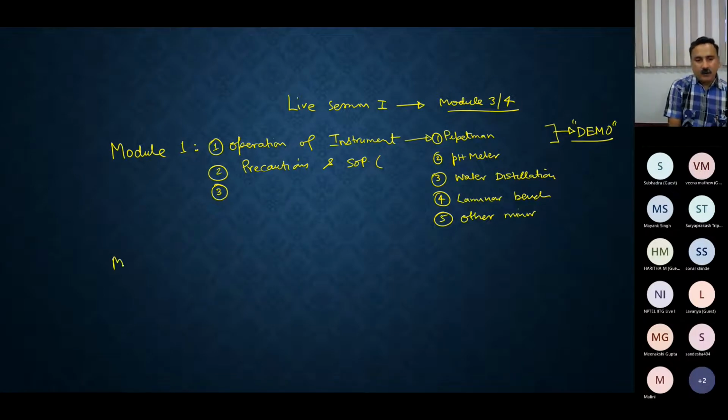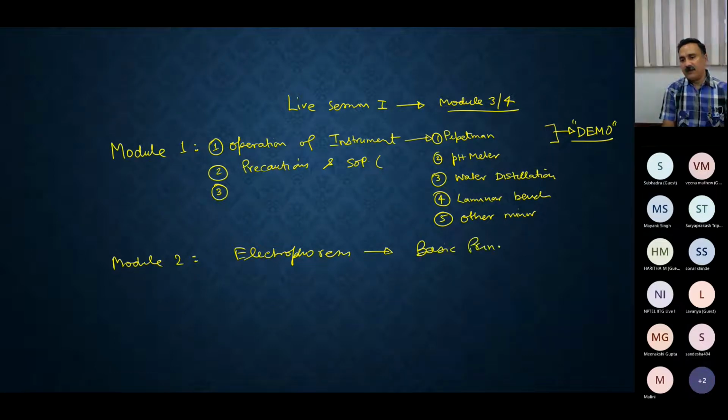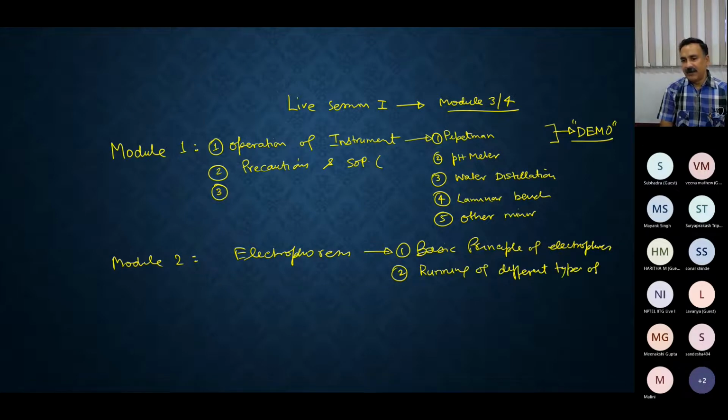Then module 2, we discuss electrophoresis, and within electrophoresis we discuss the basic principle of electrophoresis. We discuss how to run the gel, running of different types of gels, right?